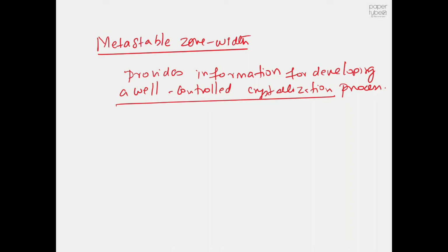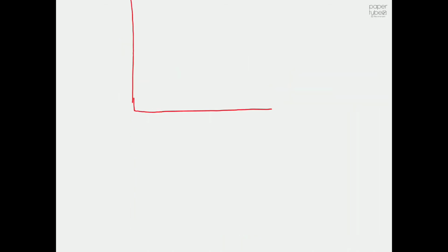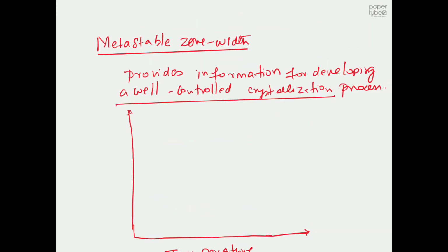So what I'm going to do is we are going to do some experiment, something like your solubility experiment. But this time we are going to add a turbidity meter into the crystallizer. As I said, the solubility line is the heart of the crystallization process. If you don't know anything about solubility, forget thinking about crystallization. So I will try to draw the solubility line again. You are going to see the solubility line again and again until we finish this topic of crystallization.